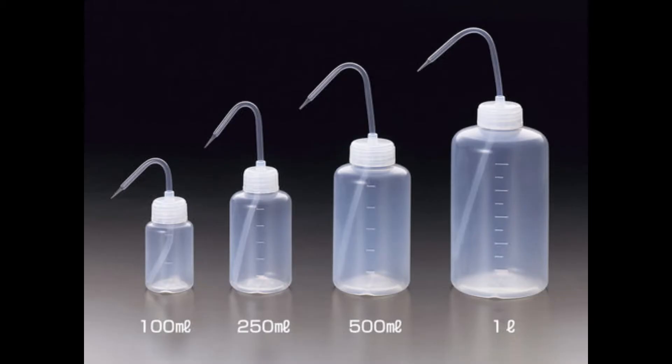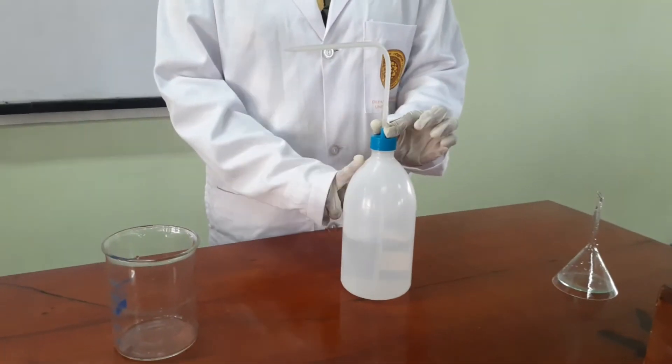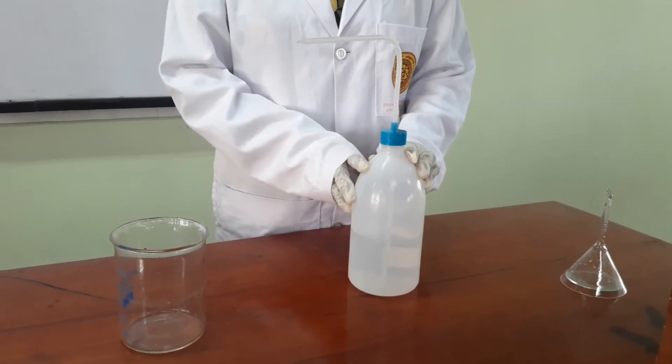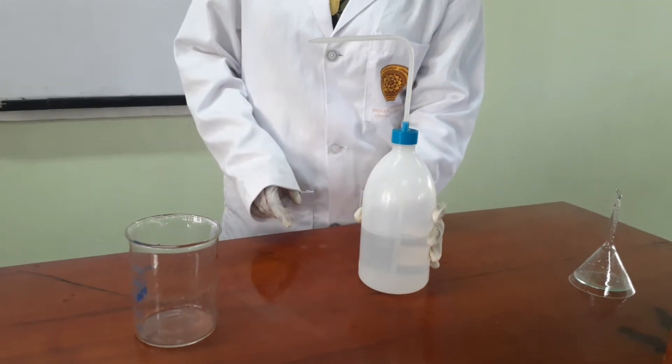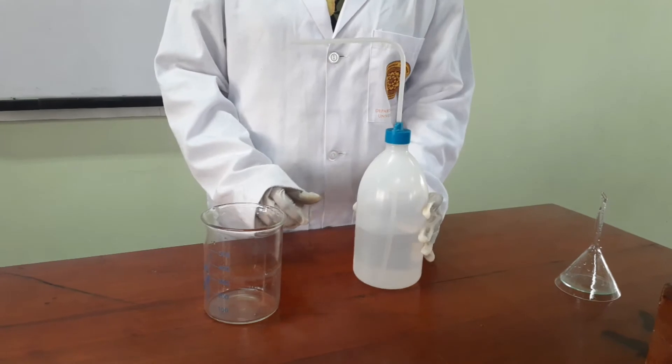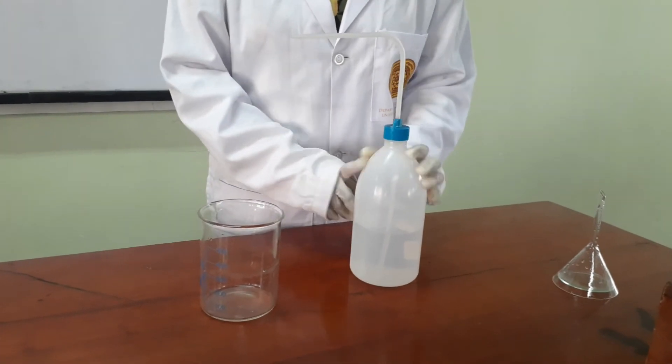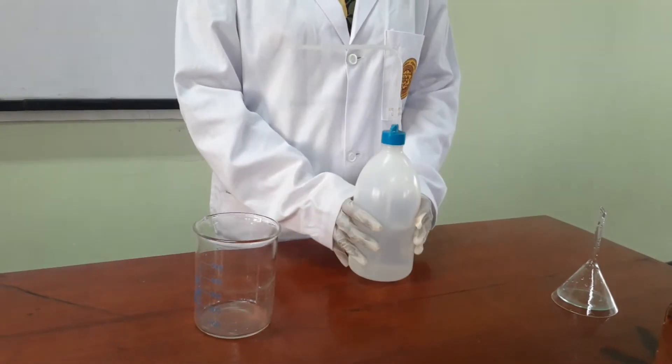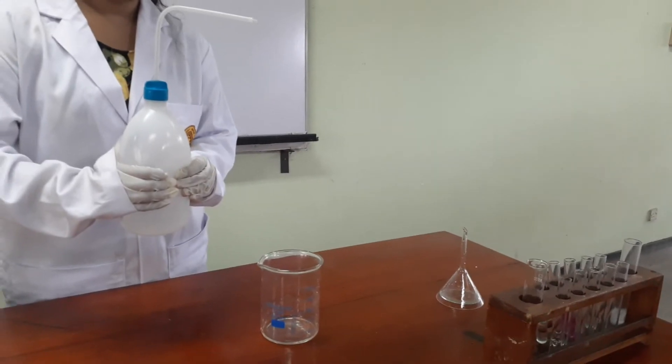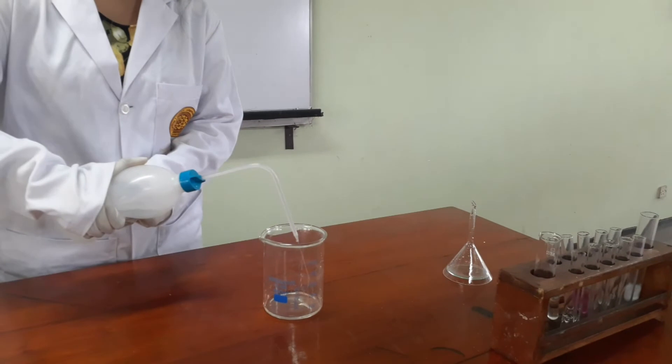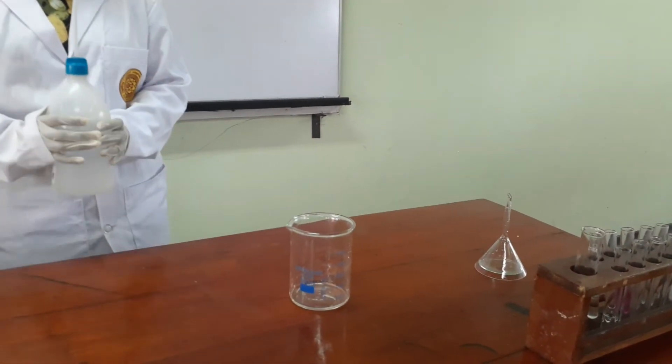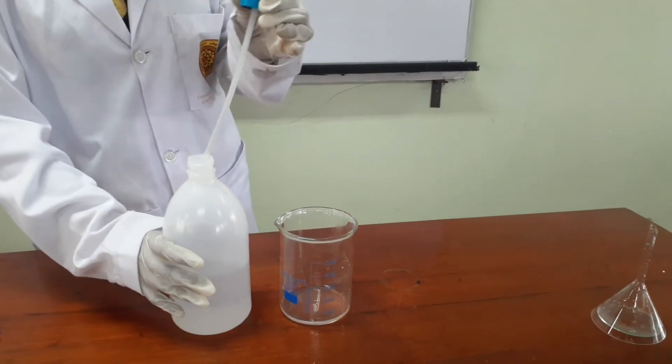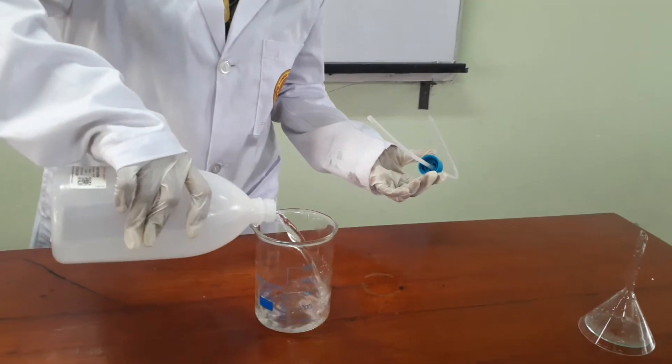Wash bottles. This is the wash bottle that we use to store deionized water or distilled water in a chemistry laboratory. We use this to get large quantity of water, somewhat less amount of water such as 10 ml, and also we use it to get very small amount of water. First, we need to squeeze the bottle like this in order to get a somewhat less amount of water quantity. And then we have to remove the tube of the wash bottle in order to get a somewhat larger amount of water quantity like this.